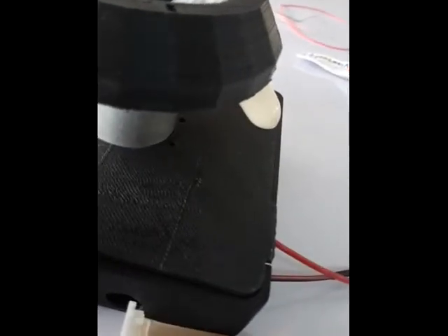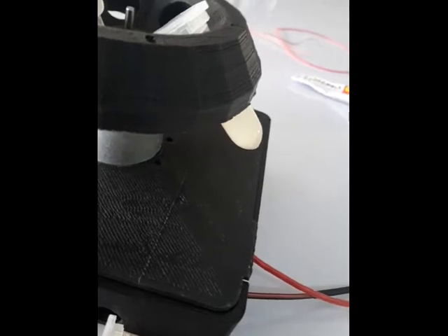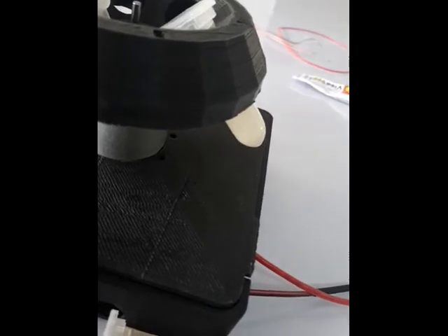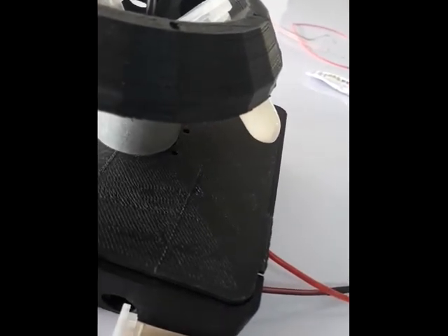This is the last take on the centrifuge. What you can see is that we put some milk samples in here and spun it for five minutes. There is already some separation of the contents — so it works!